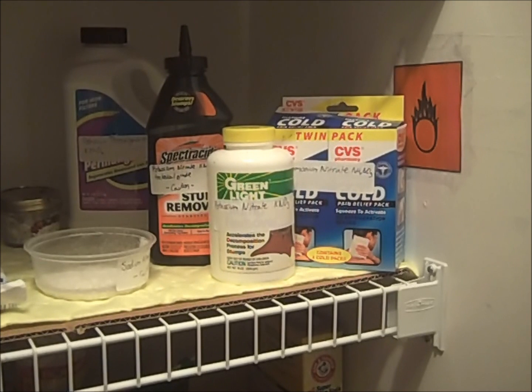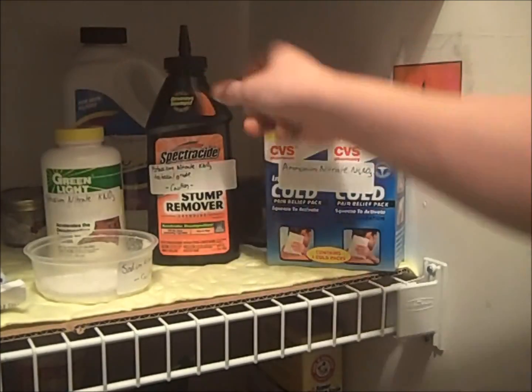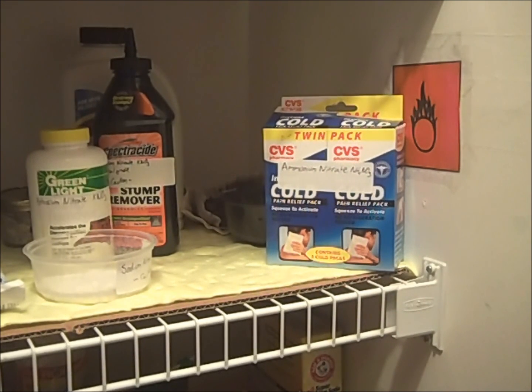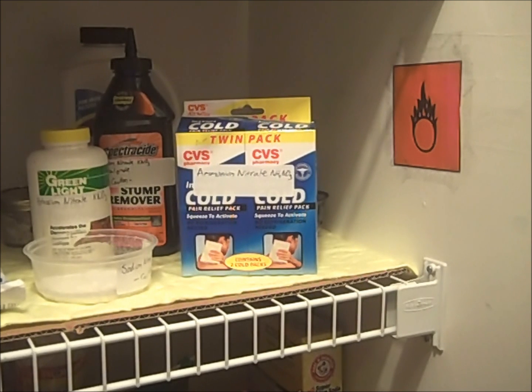We now move on to oxidizers, of which I have the most chemicals. This is potassium nitrate, which is sold as a stump remover under brand names like Greenlight and Spectracide. It is generally impure, so a recrystallization is recommended if you want to get pure potassium nitrate. This is ammonium nitrate, which is found in instant cold packs. One must cut the pack open, remove the ammonium nitrate granules, and get rid of the water pack to use it as a solid.